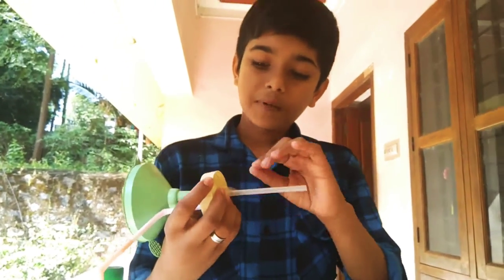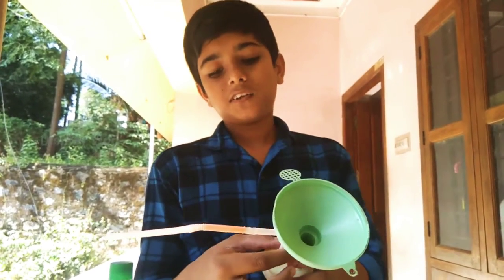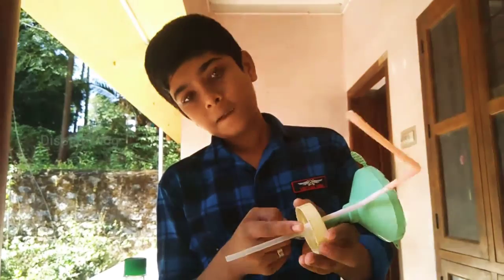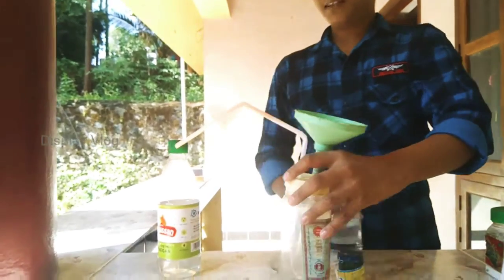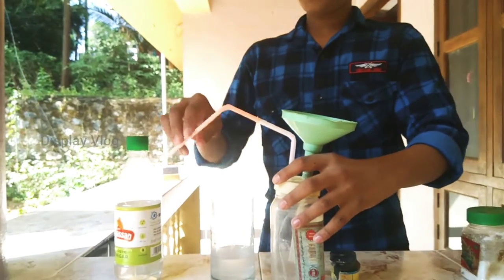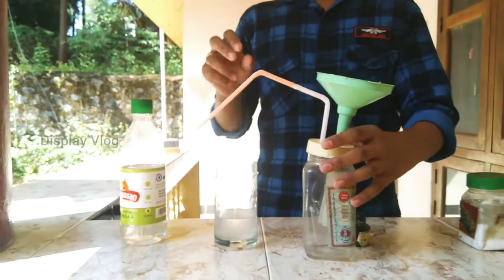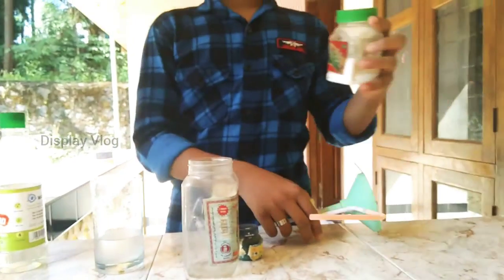Now we will have a pipe in the pot. Now let's put a pipe in the pot.